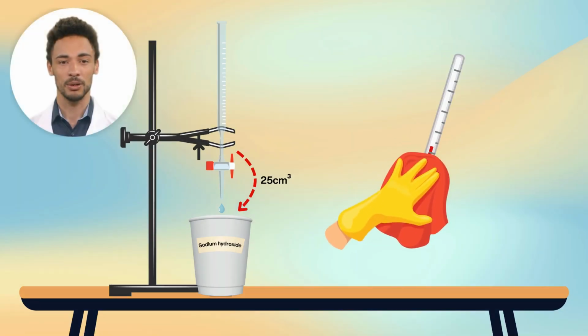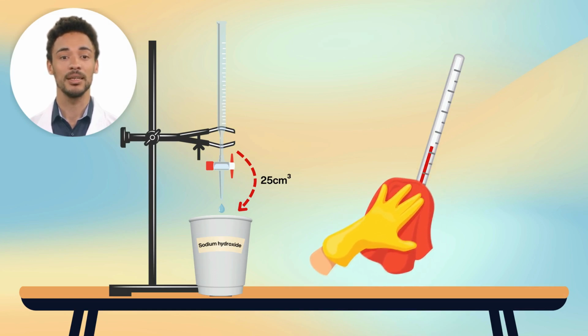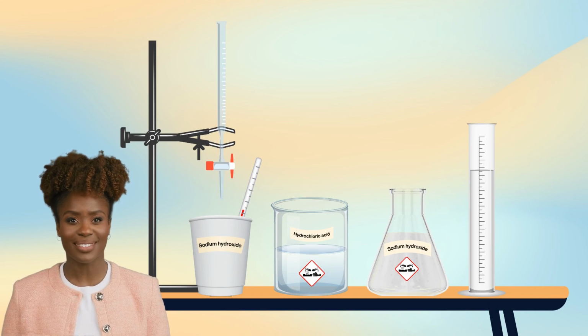Remember, to ensure that we avoid contamination, we need to make sure to clean the polystyrene cup and thermometer between each trial. Great work! We've completed our experiment.